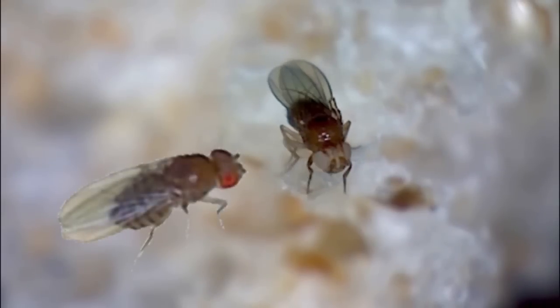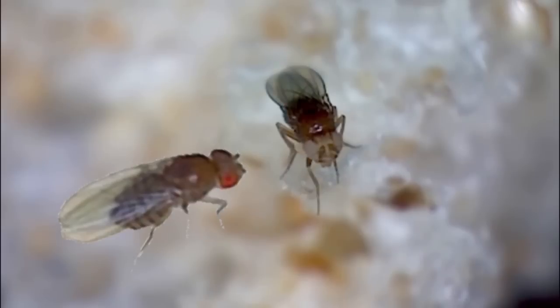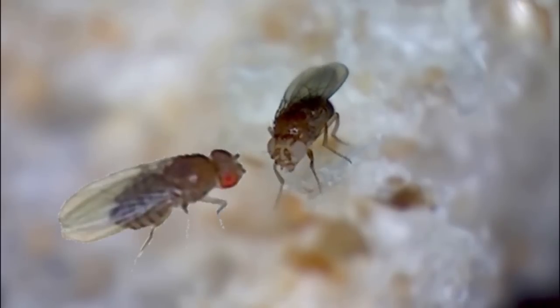Using refrigeration, we can isolate a male white-eyed fly and introduce him to our unmated red-eyed fly. The next step here is to study the first generation of this mating and record their sex and eye color.